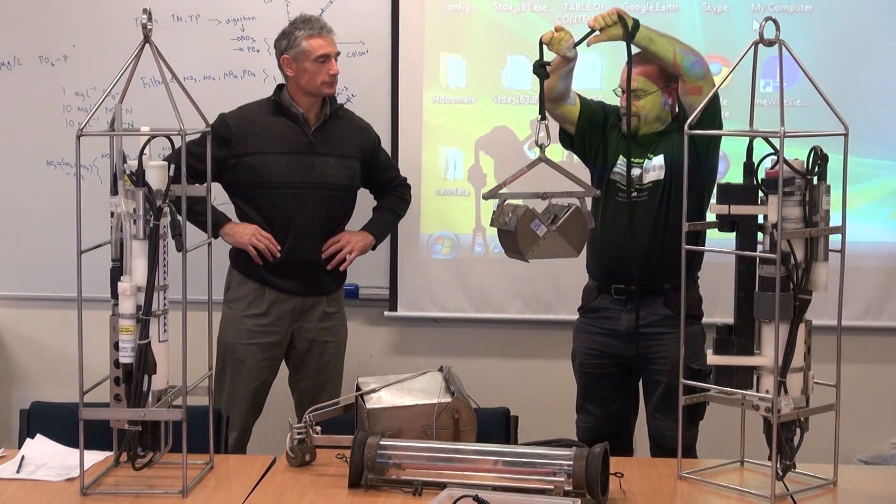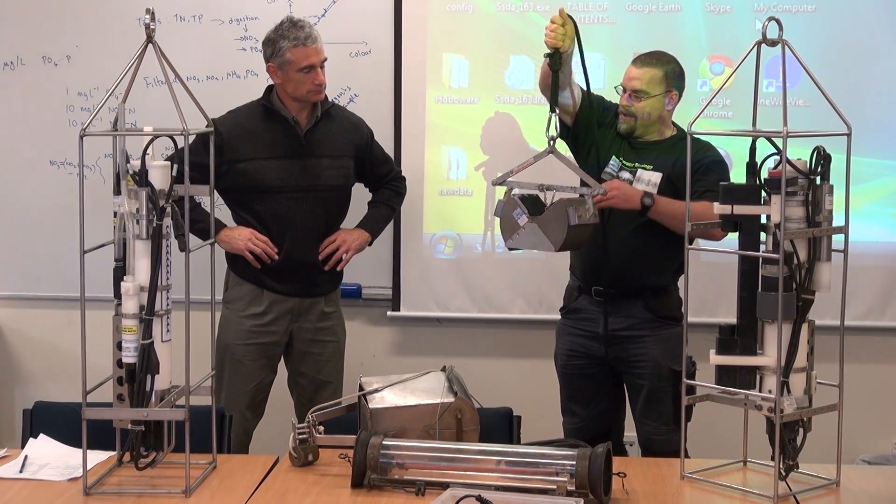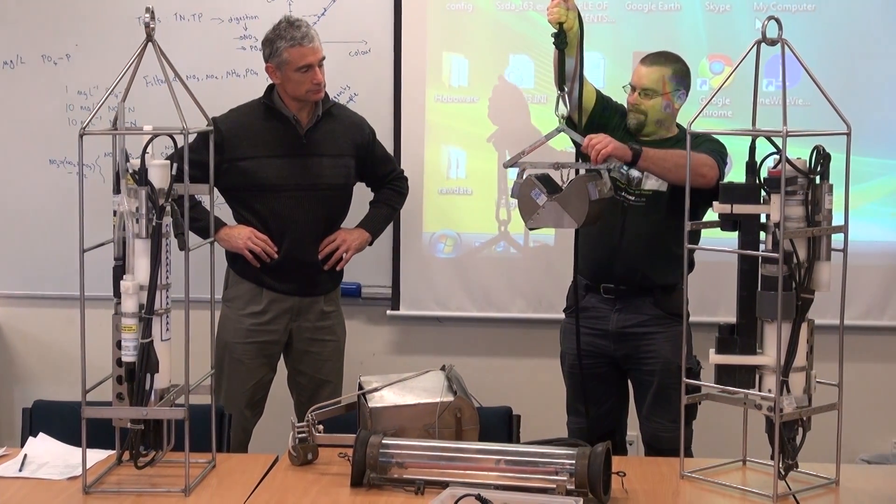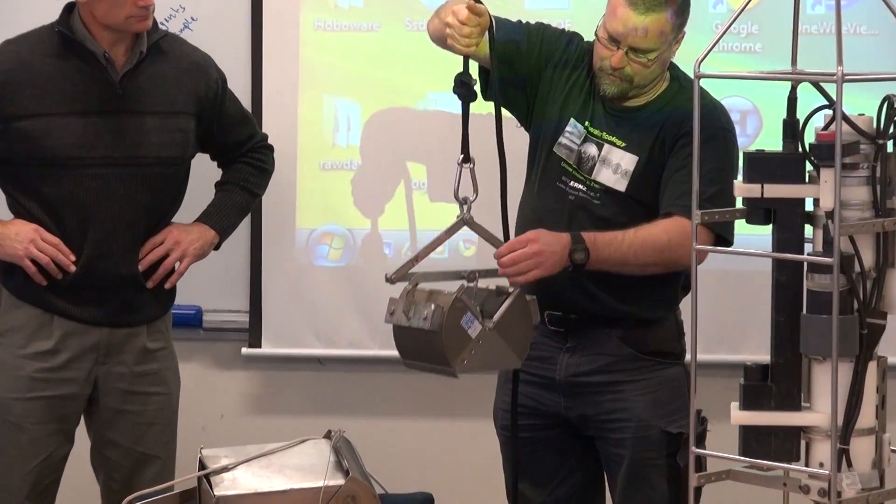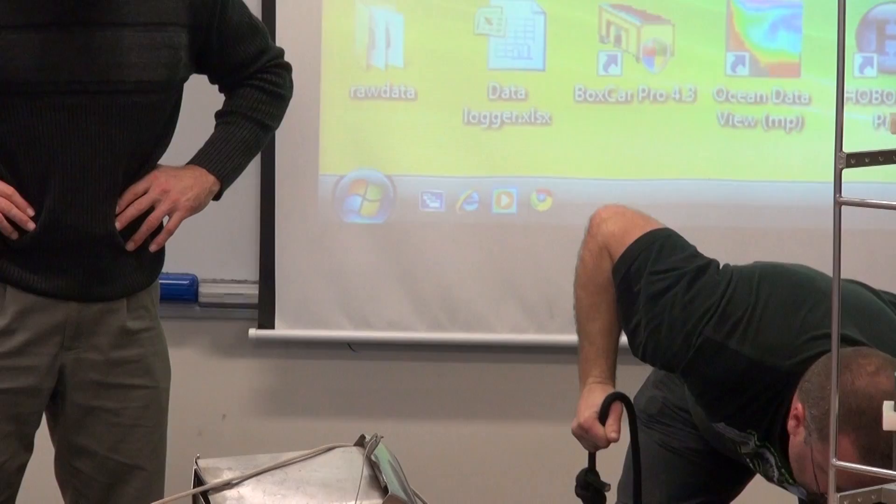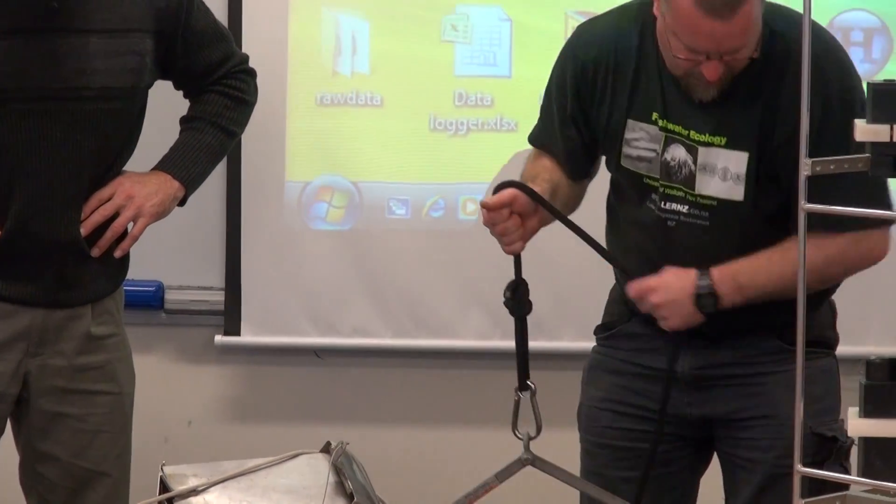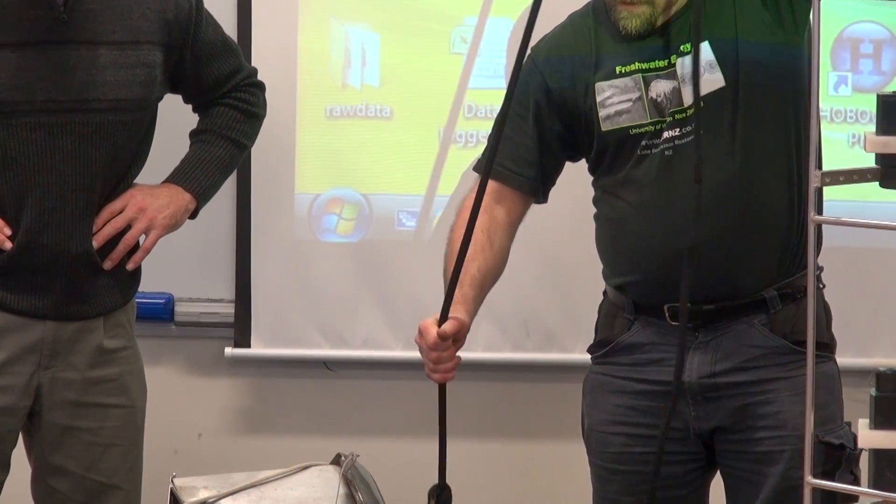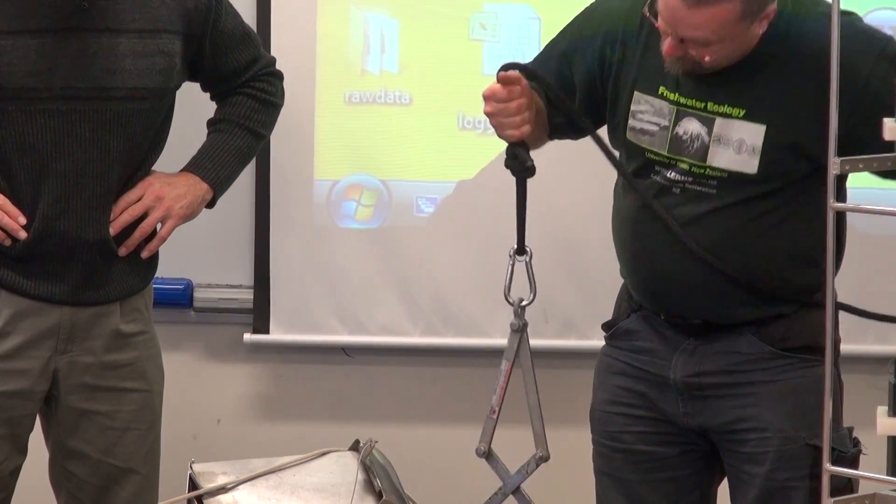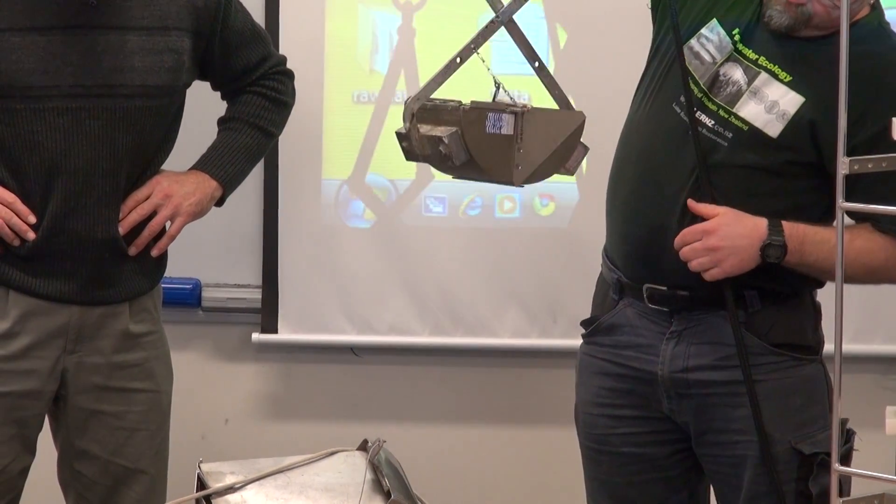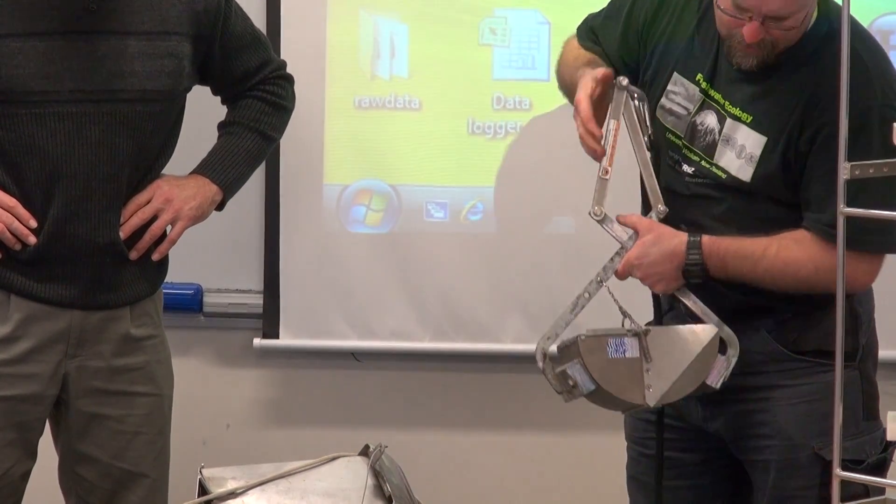That's another one, which is a ponar grab. When you're putting this together, it's very heavy. This spring goes in here, when it hits the bottom, you can actually just hit the bottom and give it a couple of good jerks, and it pops out and closes, and keeps the sediment in there.